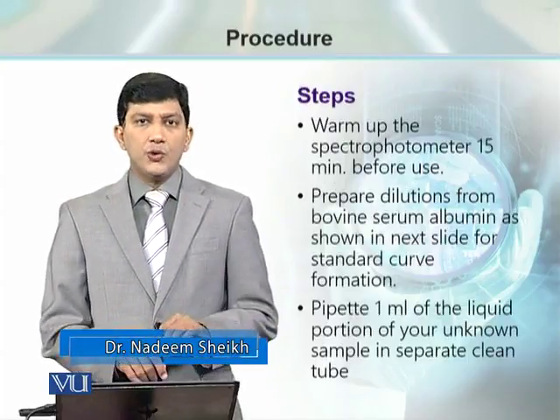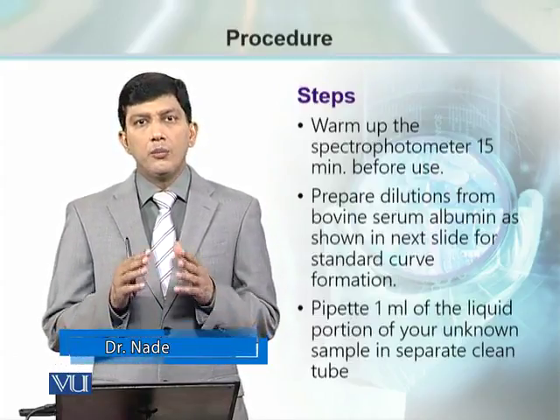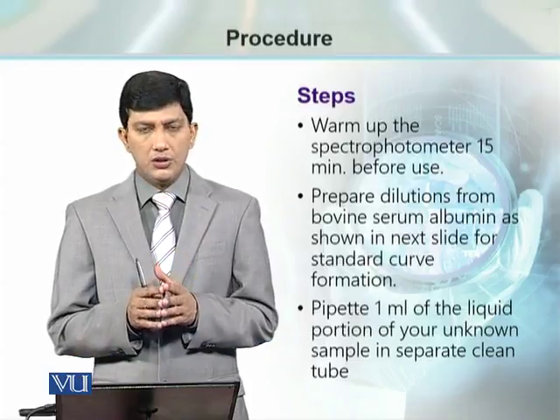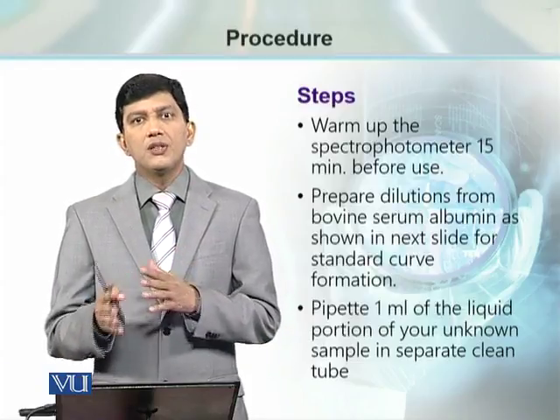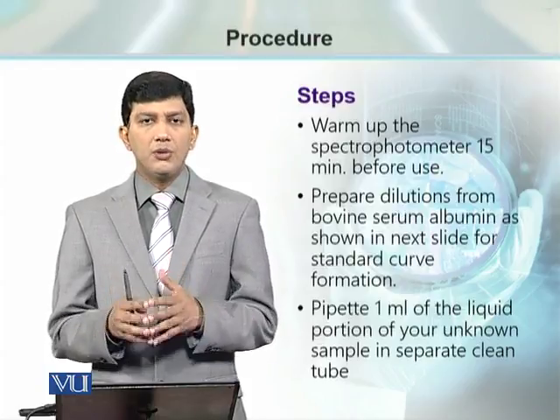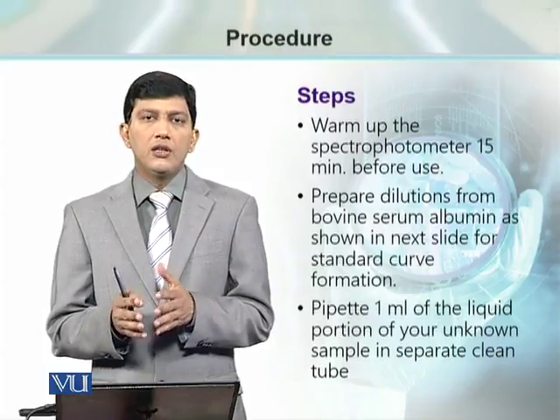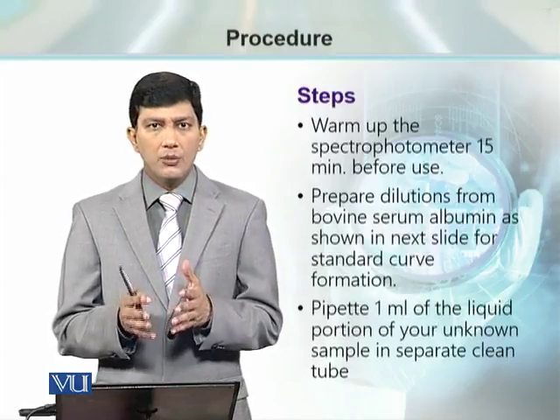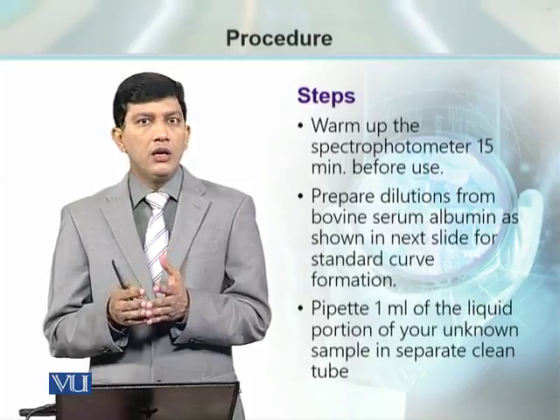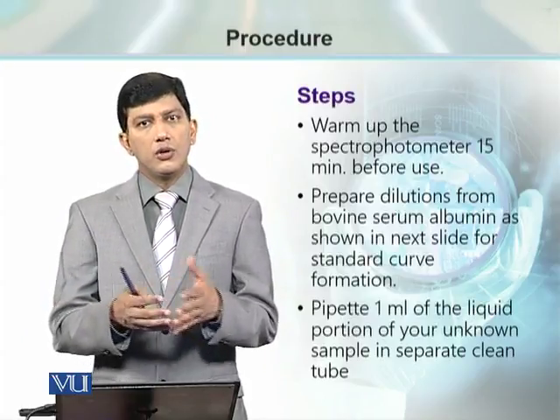As we have to use spectrophotometer towards the end of this assay, it is always recommended that you pre-warm the spectrophotometer. अब स्पेक्ट्रोफोटोमीटर को 15 मिनट पहले स्विच ऑन करना मैंडेटरी है ताकि उसकी जो एब्जॉर्बेंस वैल्यू है दैट शुड बी द एक्चुअल वैल्यू, otherwise there could be some problems in the absorbance values which are given by any spectrophotometer which is just switched on as you are going to use it.